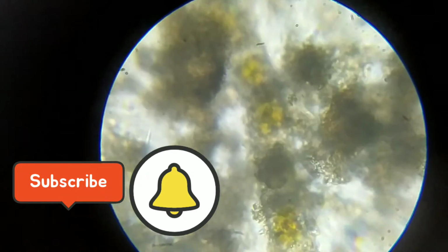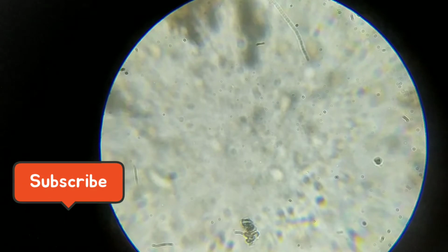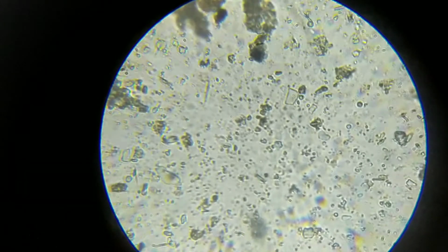Oh, I think that is a spirogyra, and smaller things have also been floating around.